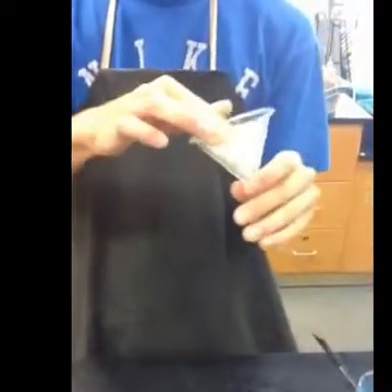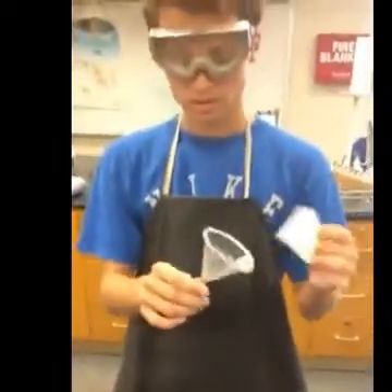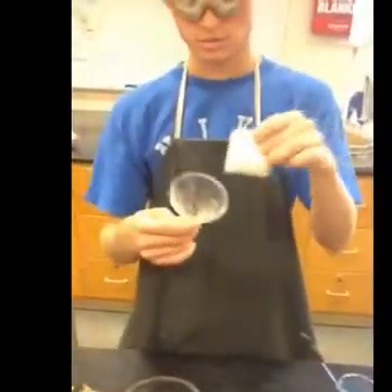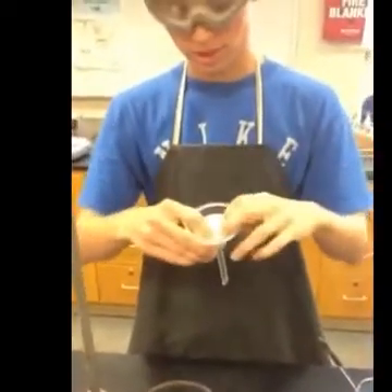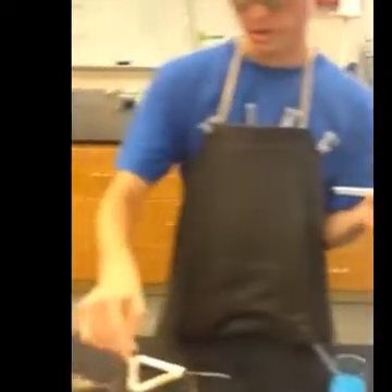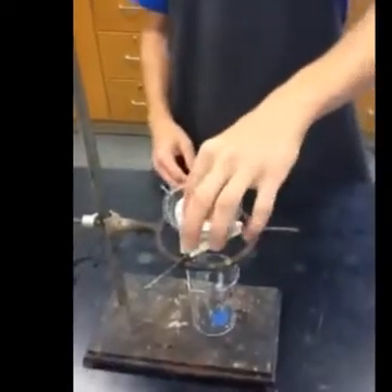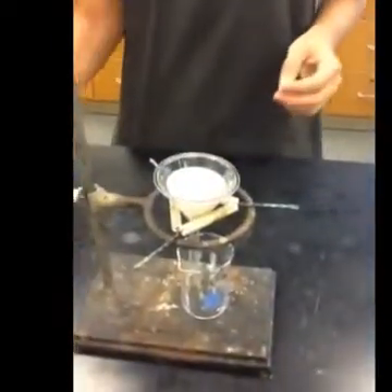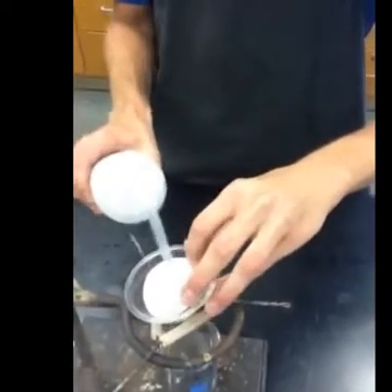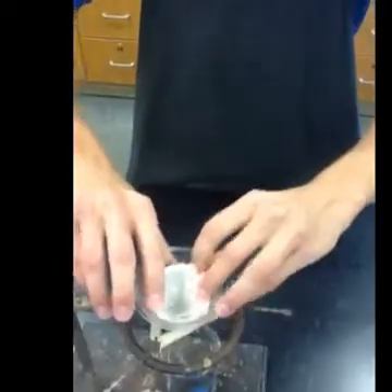Then you're going to take that and put it in your funnel. We're using a filtering funnel today — it's got these spirals and that makes it easier to filter. Put the clay triangle on the ring stand and put the funnel in the clay triangle. Then take some of your solvent and wet the filter paper, which helps it stick to the funnel.